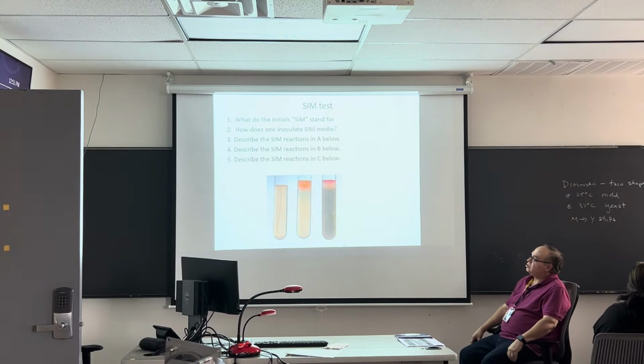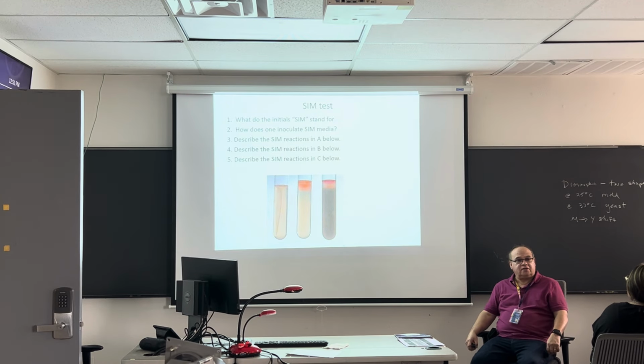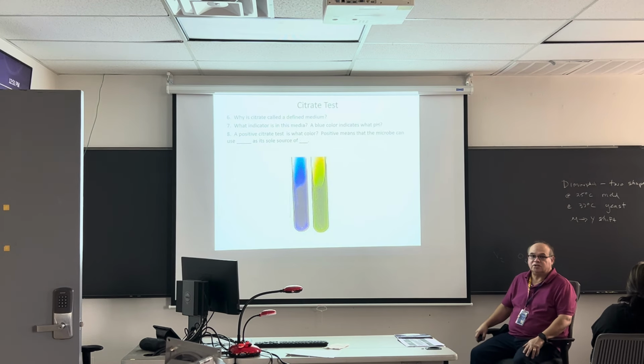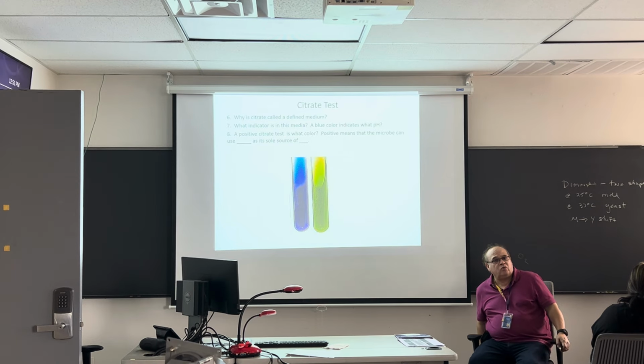Okay. So, did we cover this effectively? Does everybody understand what's going on? Okay. Let's go to the next question then. Or second question. This is citrate test. So remember, if you know the name of the test, a lot of times you know what the substrate is, right? What's being broken down.